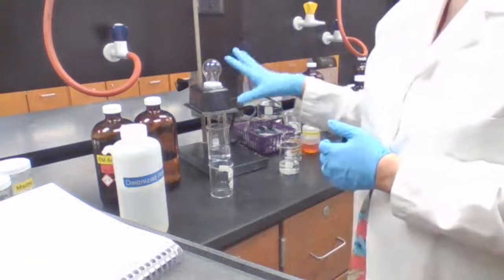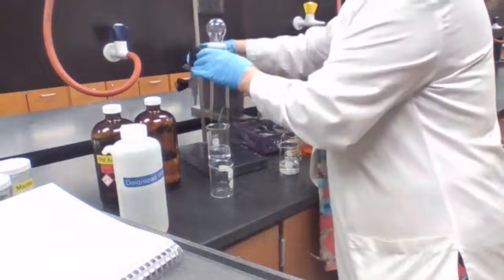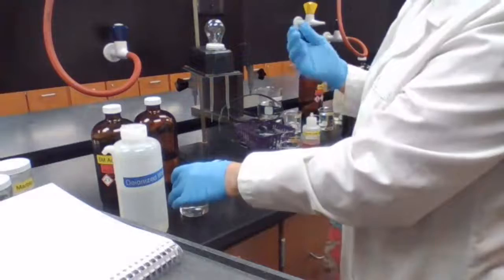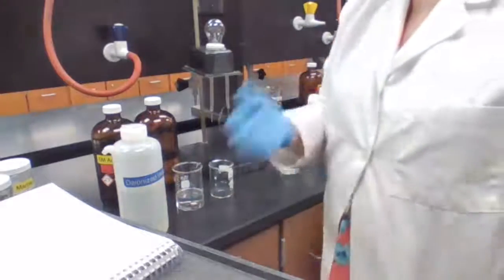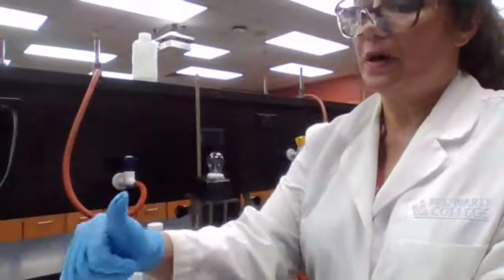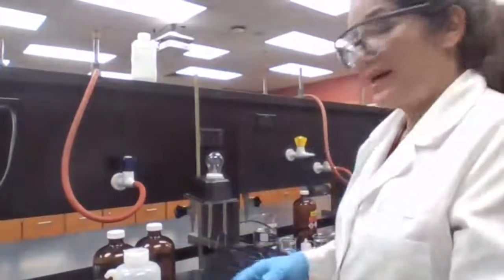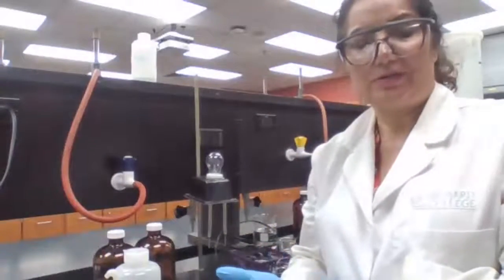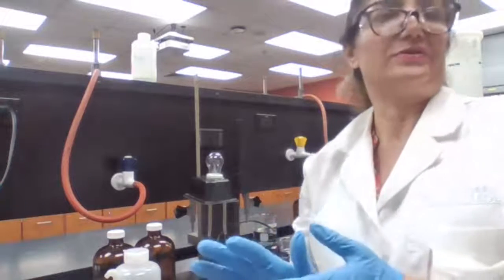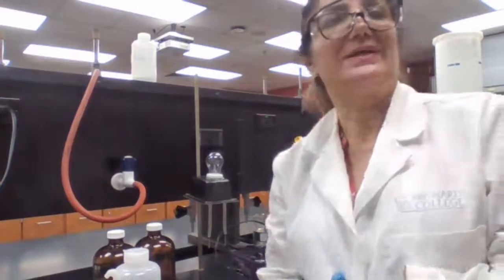This experiment was for part 2-1. That means part 2-1 is the first ionic reaction, or typical ionic reactions. The second reaction is the reaction of ammonia with acetic acid. Aqueous acetic acid was a weak electrolyte. Aqueous ammonia is also a weak electrolyte.